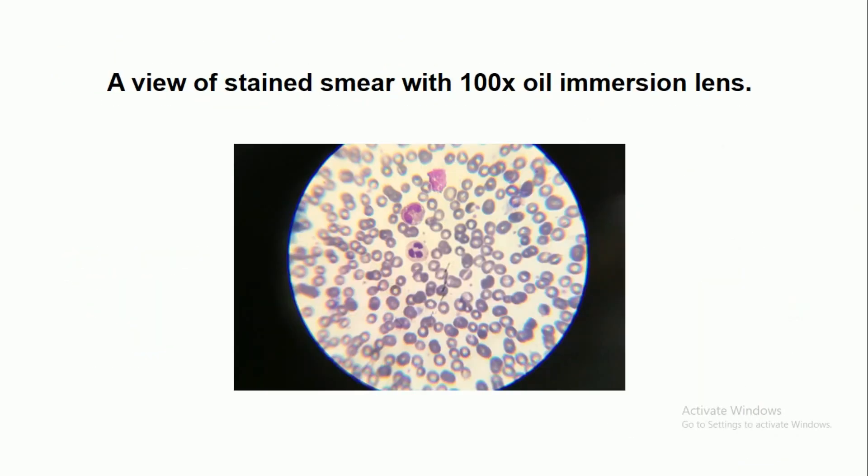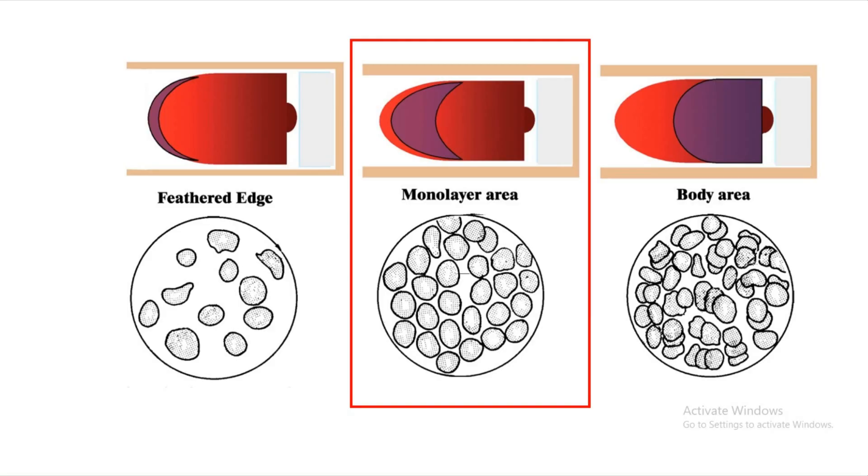You are now seeing a view of the stained smear under the 100x oil immersion lens. As shown in the figure, focus over the monolayer area for examination.